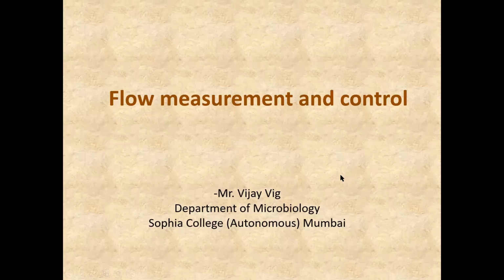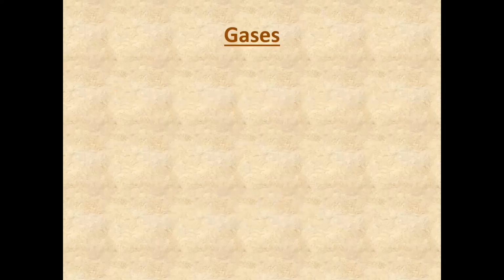Hi everyone, in this video we will learn monitoring of flow rate of gases and how to control it. That is flow rate measurement and control of gases in a fermentation. How would you monitor the flow rate of gases during a fermentation?